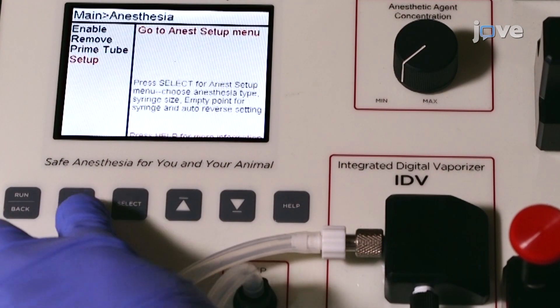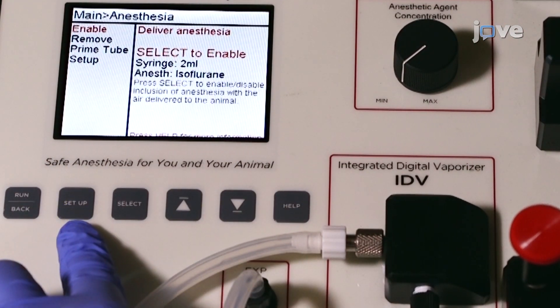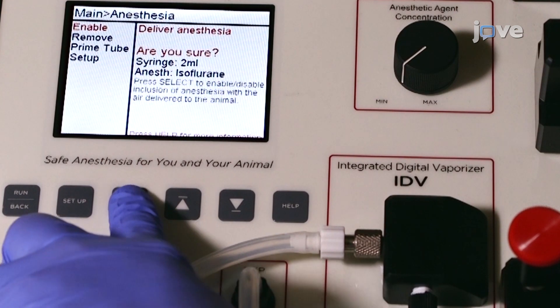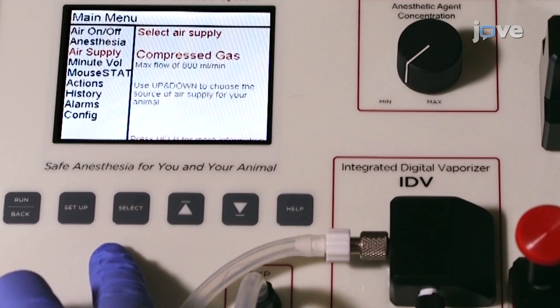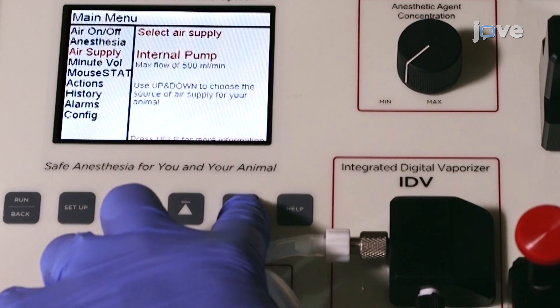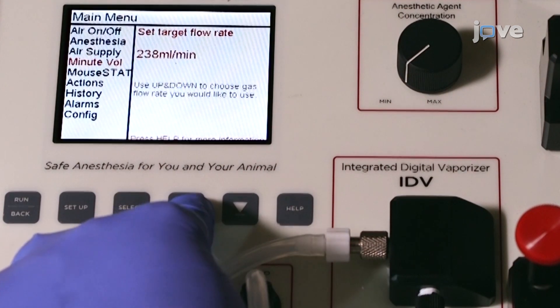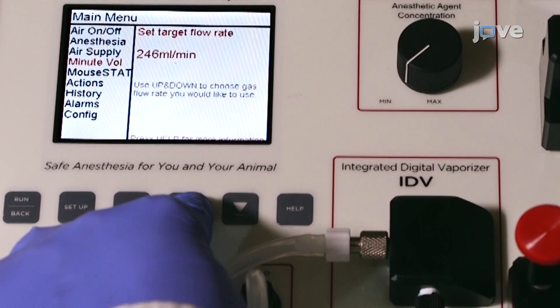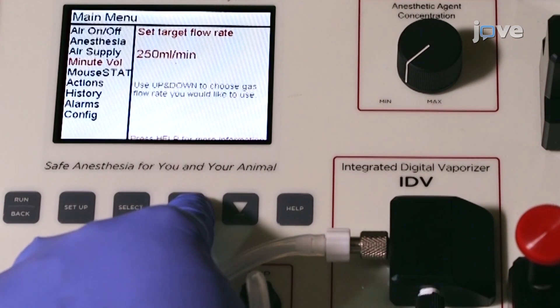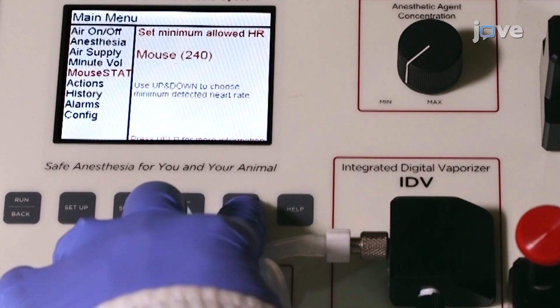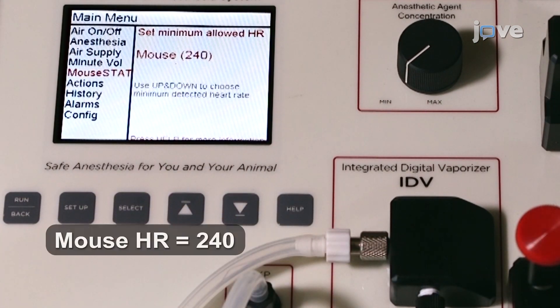Once all settings are made, enable anesthesia delivery. Now select the air supply to room air and the minute volume to 250 milliliters per minute. For physiological monitoring, set the minimum detected heart rate to mouse.